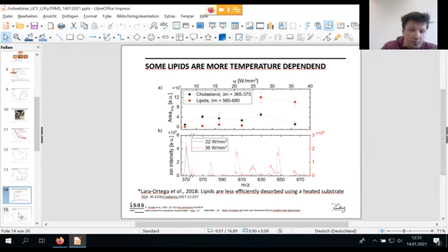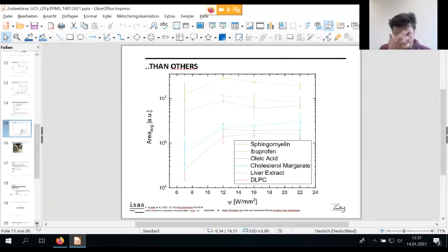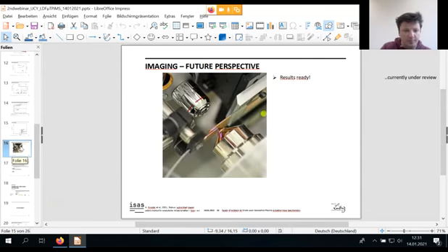That would be a cool application. Some other compounds that I tested also come with a different intensity threshold. So this might be an interesting topic, although the arbitrary ion current is hard to link yet without known pressure.